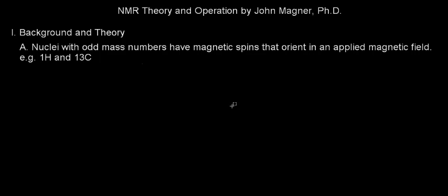In this video I'm going to discuss the theory behind nuclear magnetic resonance spectroscopy, also known as NMR, and I'll also talk about how NMR spectrometers operate.